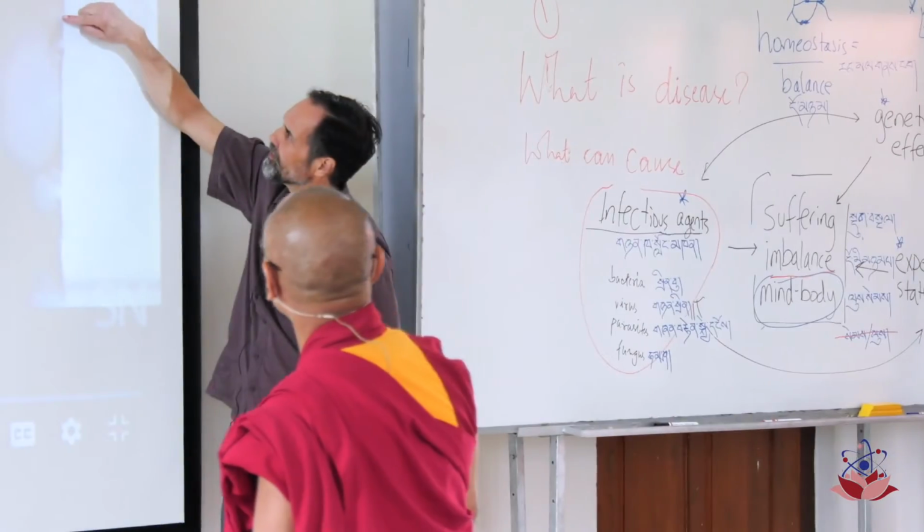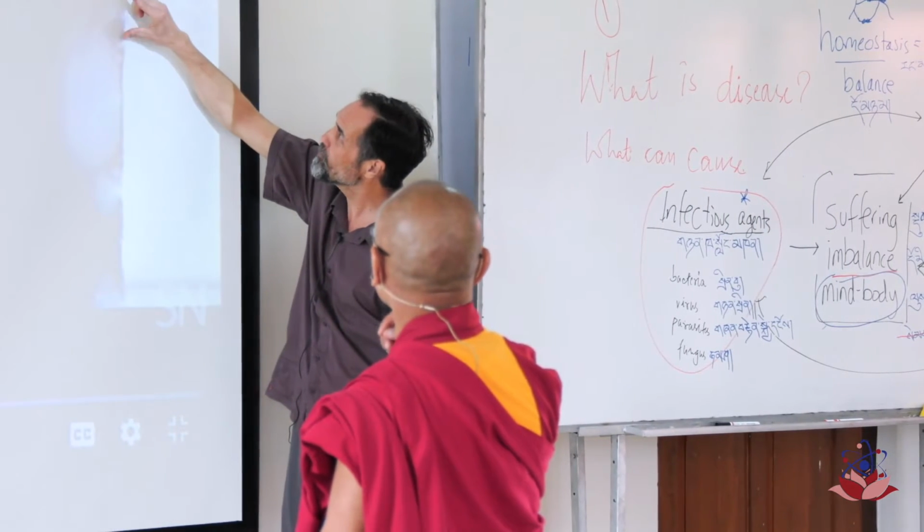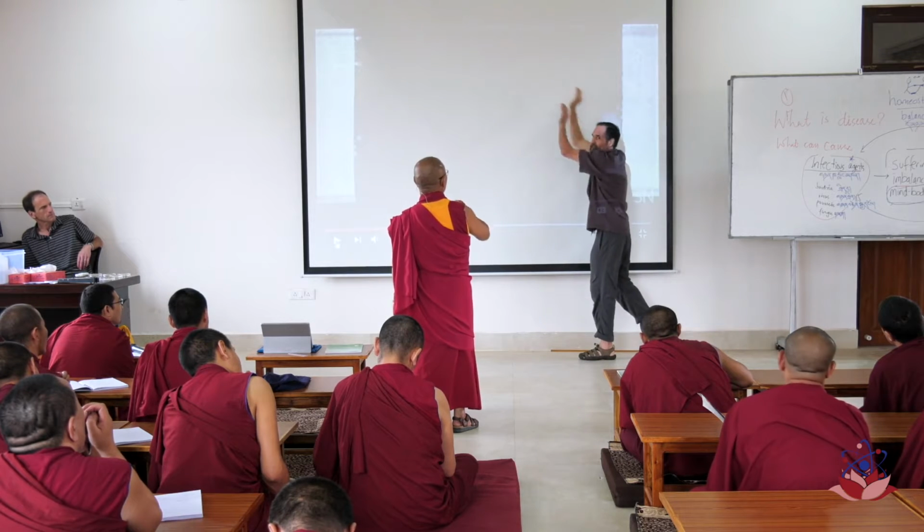Because they're growing, small colonies are growing from one spot. Not everything at once.